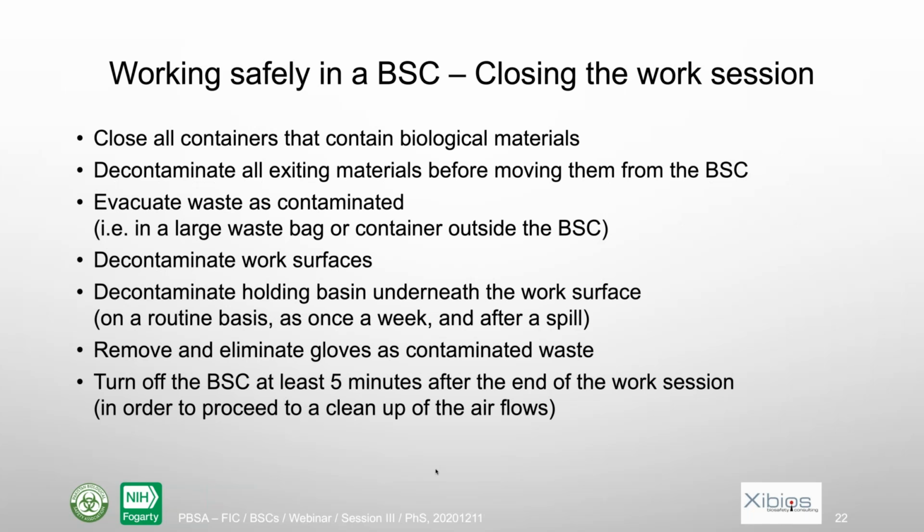The third part of such an SOP should be about closing the work session. First, you should do all that with your biosafety cabinet still working, because it will keep protecting you during that time. When working, we should close all the containers that contain biological agents, biological materials, including the waste bin, for instance. We should decontaminate everything that goes out, including, again, that waste bag or container, and move out of the biosafety cabinet. Contaminated waste inside of that small waste bag should be put into a larger waste bag or a container outside of the biosafety cabinet.